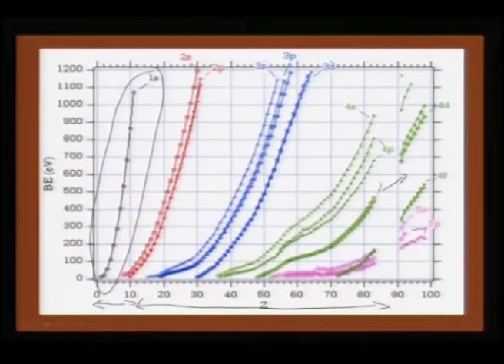Therefore, there are some gaps here, for which we can see how we can account for those regions. Mainly those are heavier metals, therefore, you would see those missing data present here. Okay. So, bulkier the atoms, then you have this Aufbau principle dictating the binding energy.